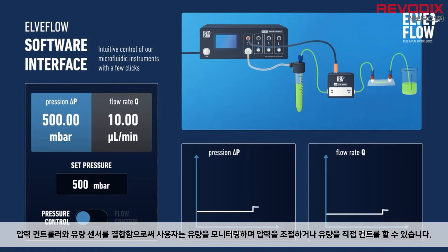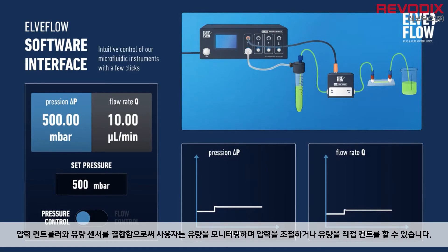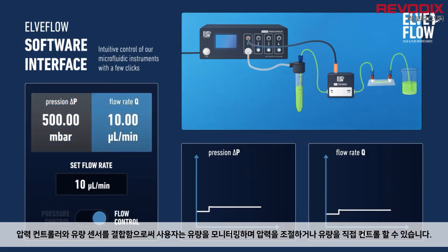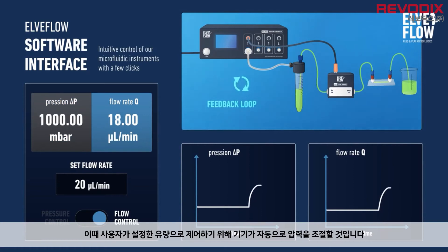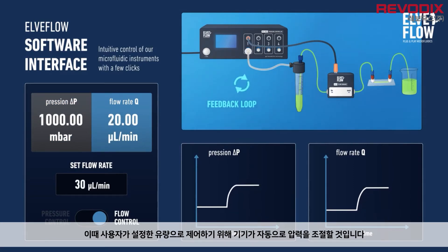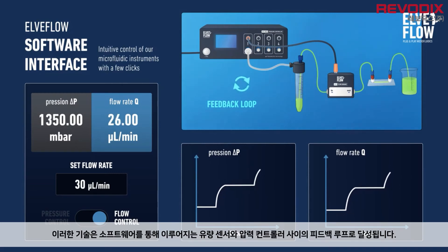Combining a pressure flow controller and a flow sensor offers the advantage of working in either pressure control with flow rate monitoring, or in flow rate control with the inlet pressure automatically adapting to reach the target flow rate. This is achieved through a feedback loop between the flow sensor and the pressure controller via the control software.